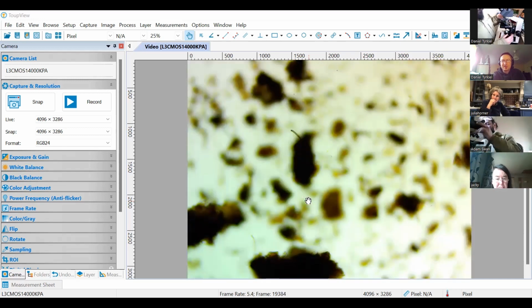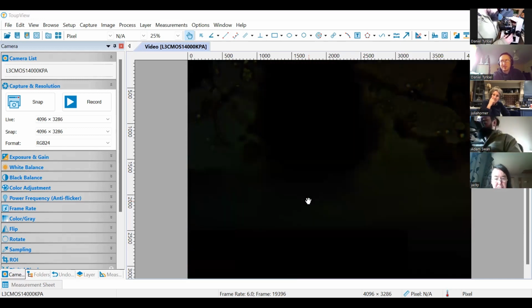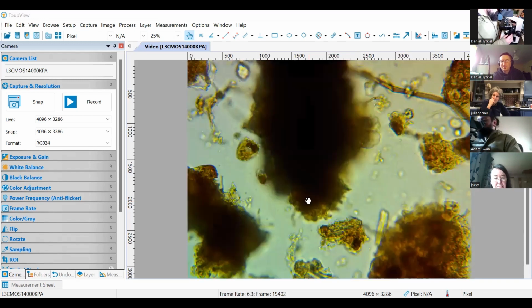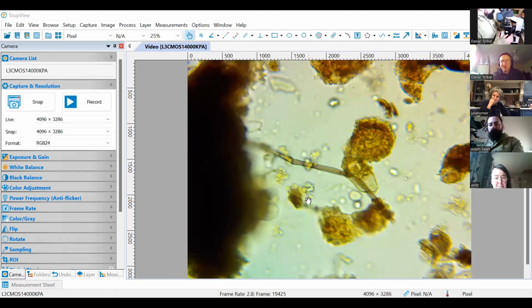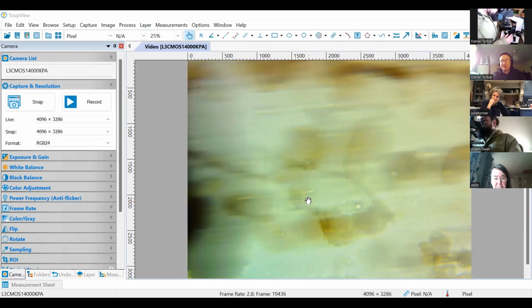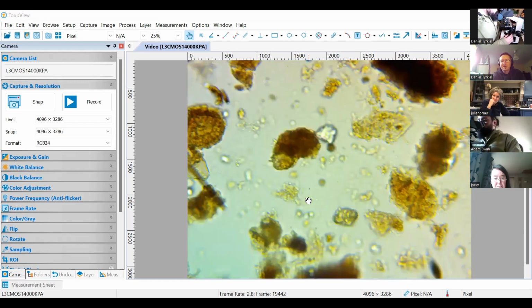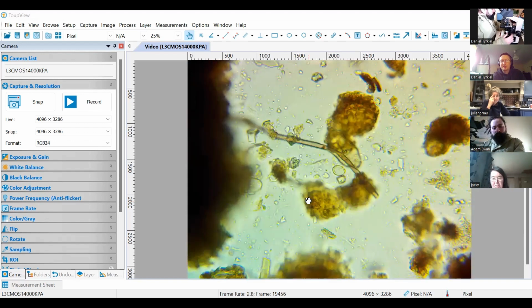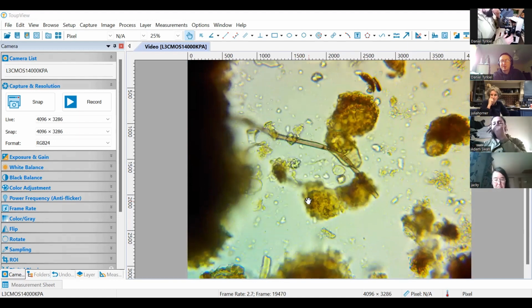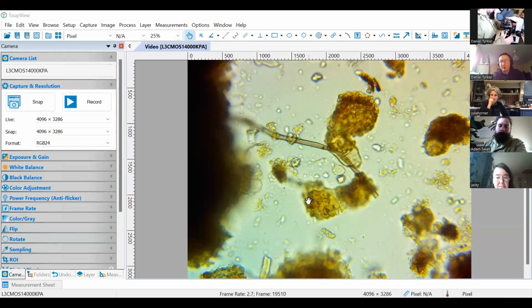So the spreadsheet that we use, and the software that Dr. Ingham's students use, they all calculate standard deviation. And standard deviation for all the other organisms is usually fine within 1 drop. And there's a difference between measuring nematodes and measuring other organisms, in the sense that you count nematodes at 100 times magnification and you see the entire drop. And so if you don't see enough in 1 drop, then you go to other drops.